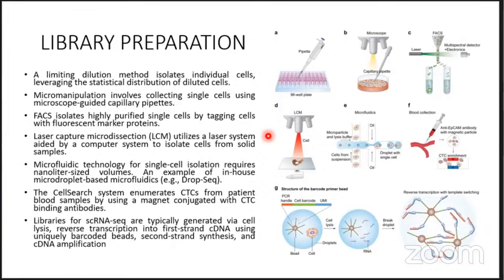So using this LCM microscope, we pick up only a single cell from the tumor, not from any other area. Another method is the microfluidic technology for single cell isolation. It requires only nanoliter volumes, not more than that.